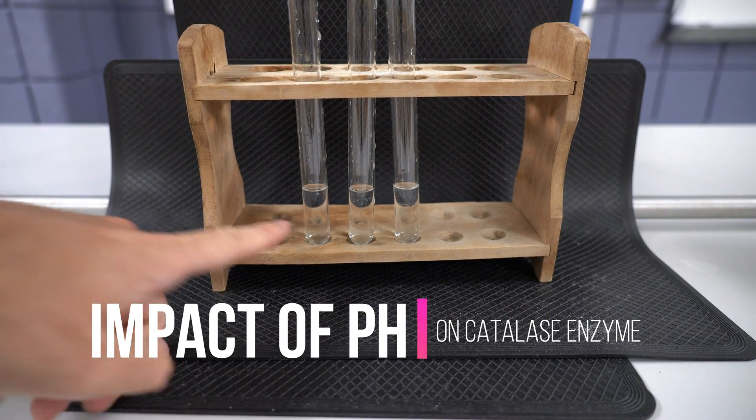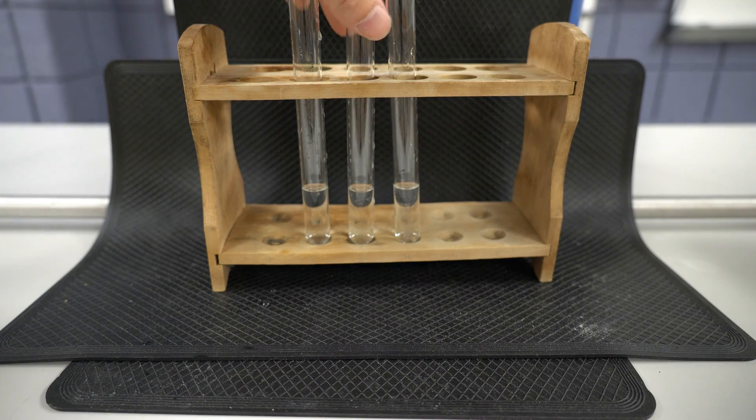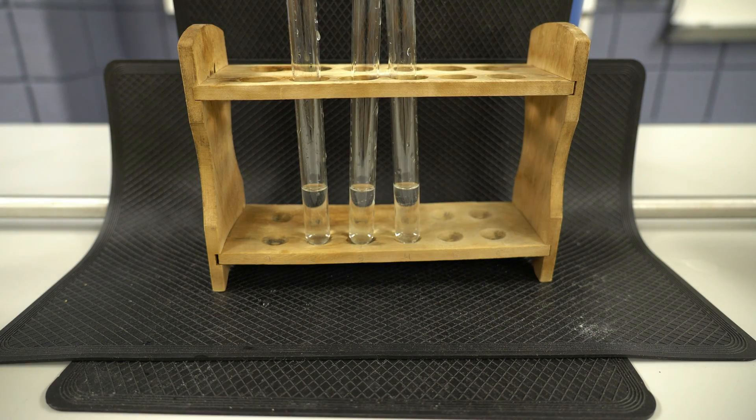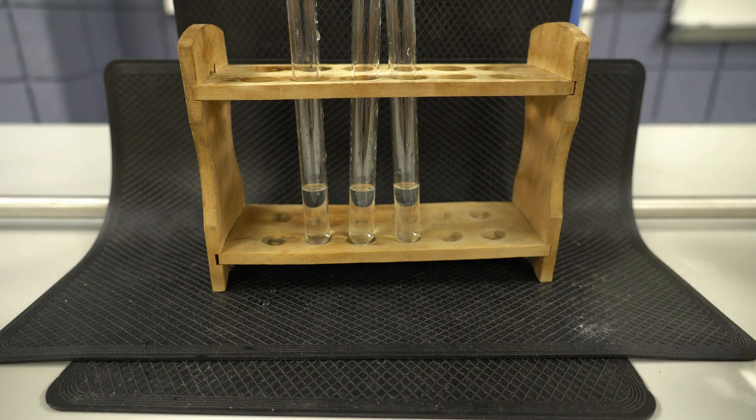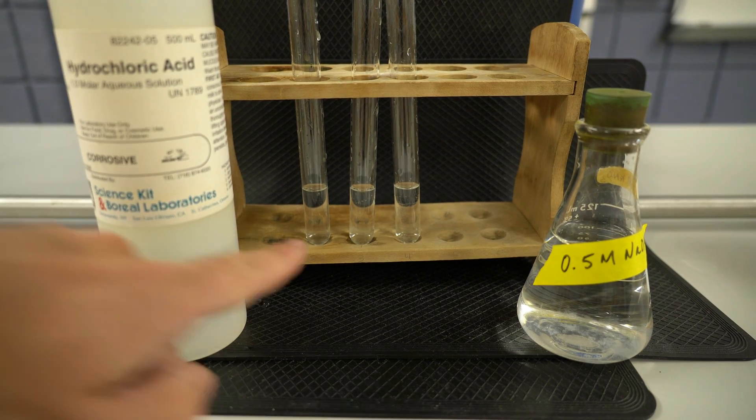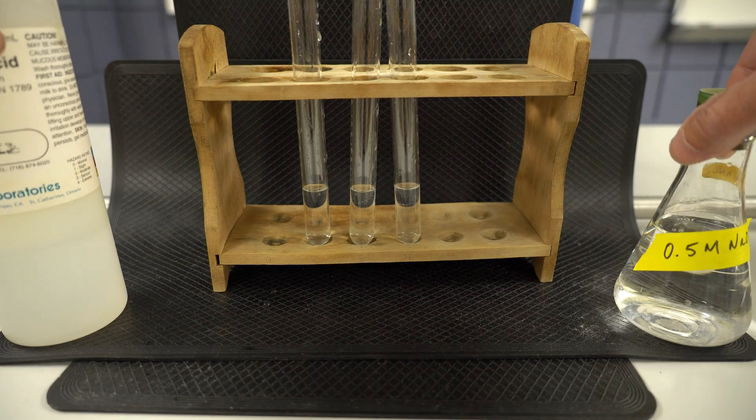So we're looking at pH. In the first test tube, I've added hydrochloric acid. This middle one is regular tap water, very neutral pH. The last one has had sodium hydroxide added to it. We're increasing pH from a very low pH to a neutral pH to a basic pH.